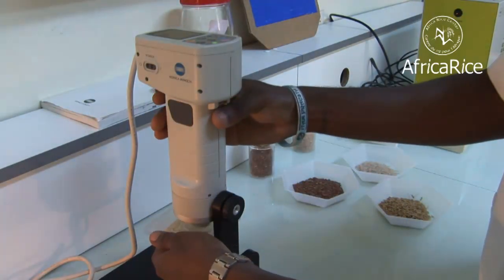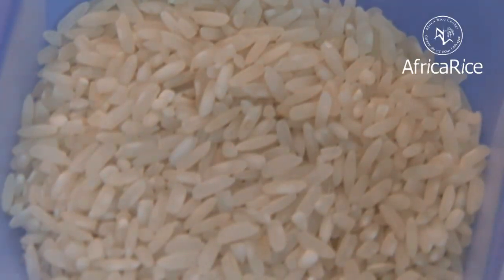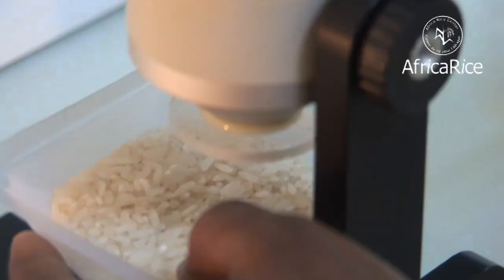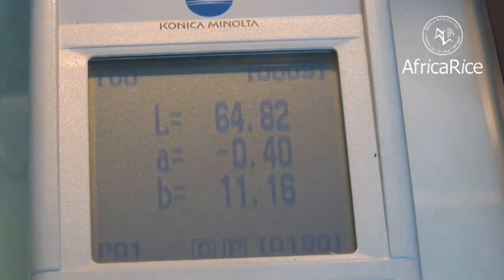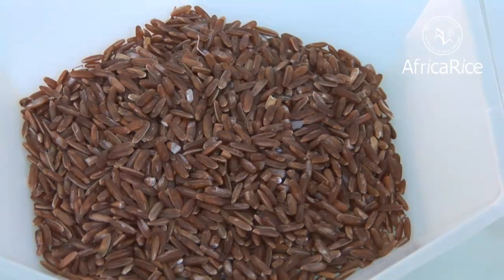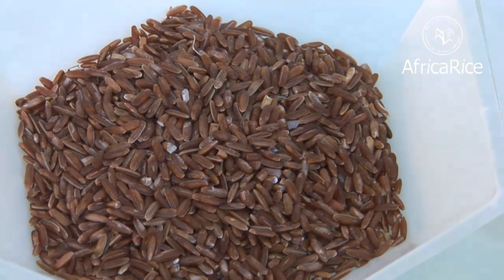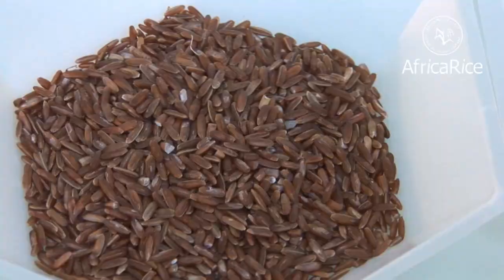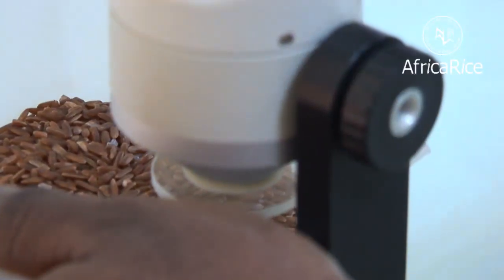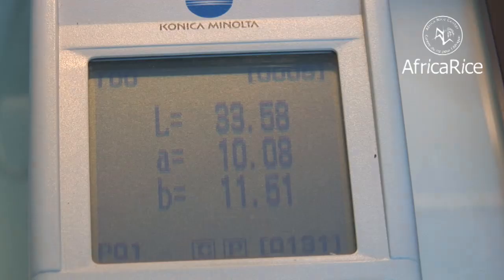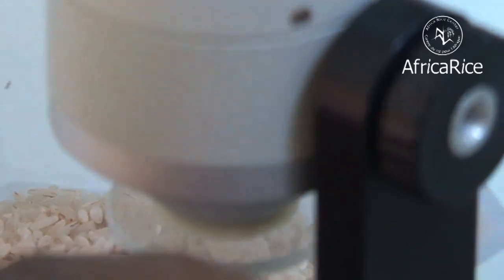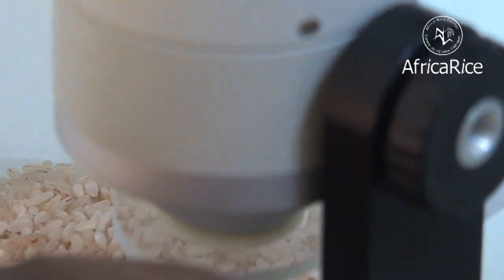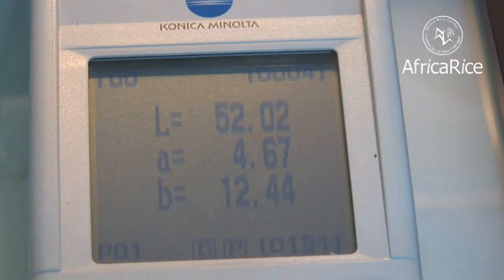A color meter or chromometer is used to measure the color coordinates of different rice varieties. It can also help to determine the degree of milling of the rice and the intensity of parboiling of a rice sample.